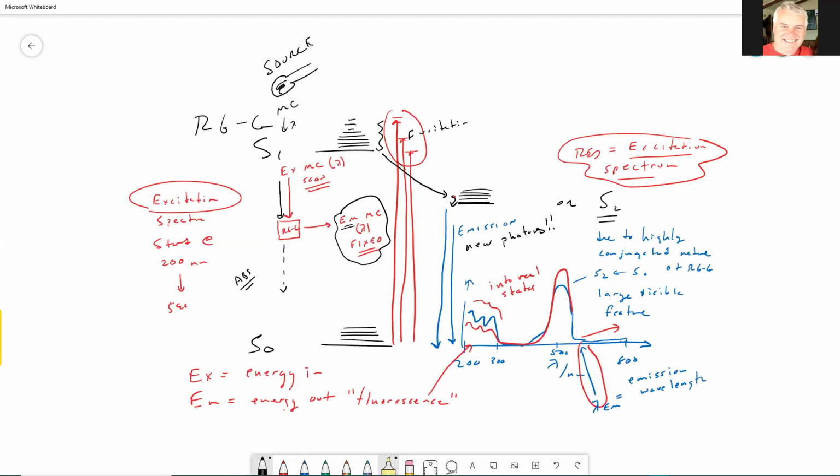Kenya says yes, Romel says yes. Good, excellent. And basically by changing the wavelength, by changing the energy, you can scan through these states. You can scan through all these different states here. Does that make sense? William says, oh, good, excellent. Tyler, how you doing? Good? Sue, you tracking, Sue?